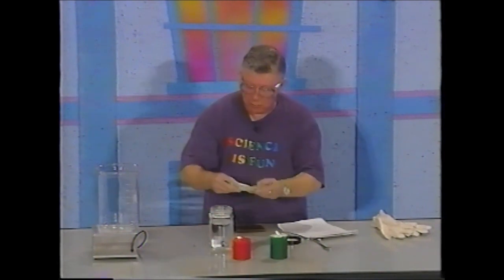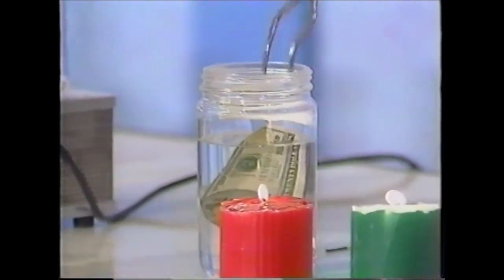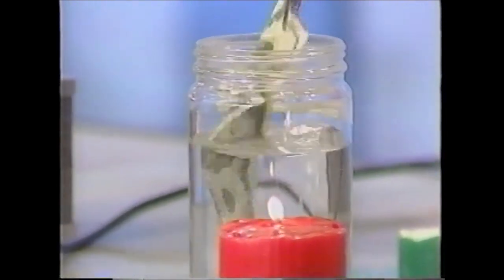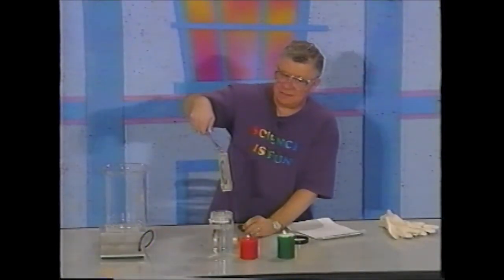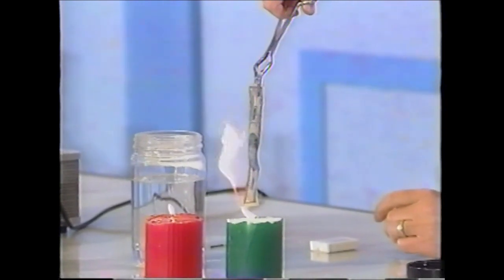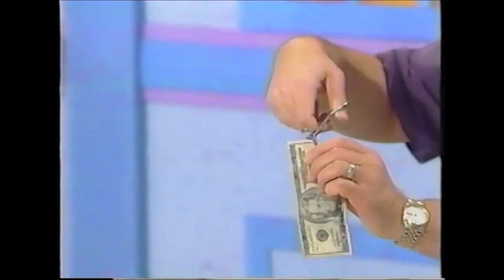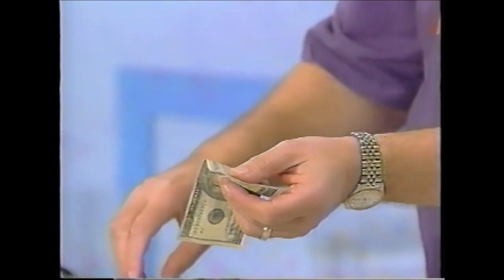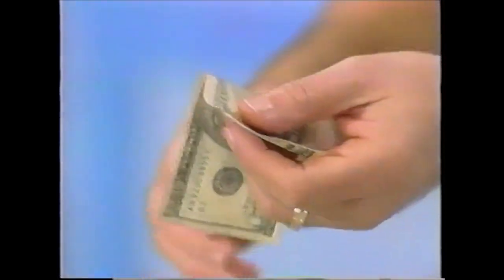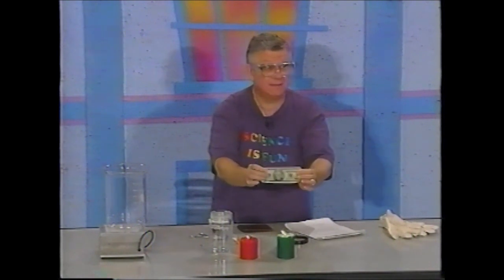And what I'm going to do is take the $20 bill, and I'm going to soak the $20 bill in this clear and colorless liquid, and then I'm going to fish it out, and you see it's dripping like any wet object would. And now I'm going to bring it to the flame, and there you see the $20 bill on fire. Or not? You did see a flame, right? That flame, you did see a flame, but the $20 bill is intact.